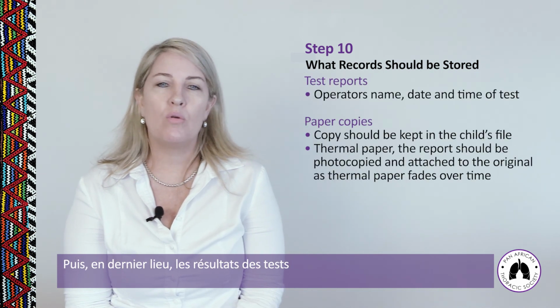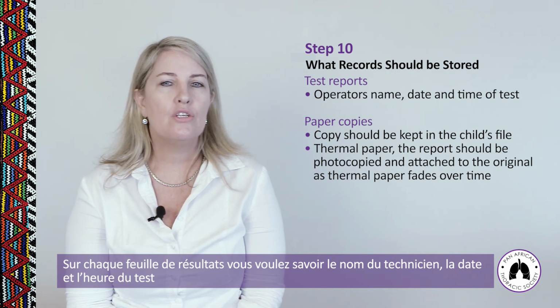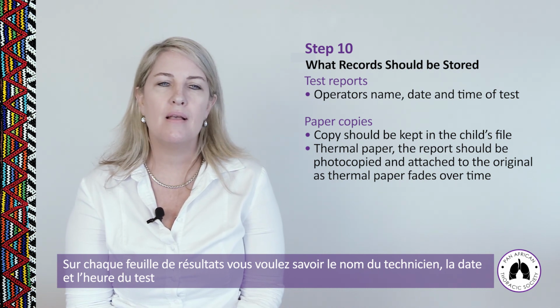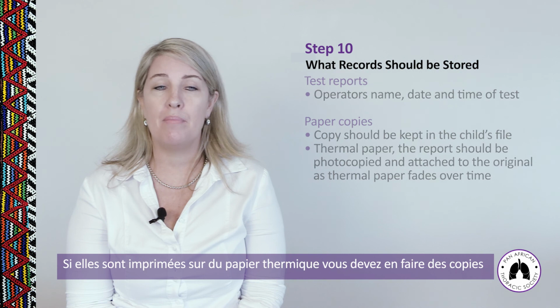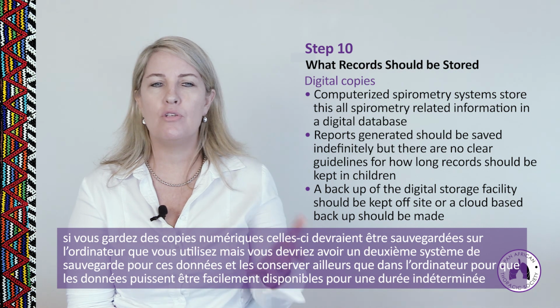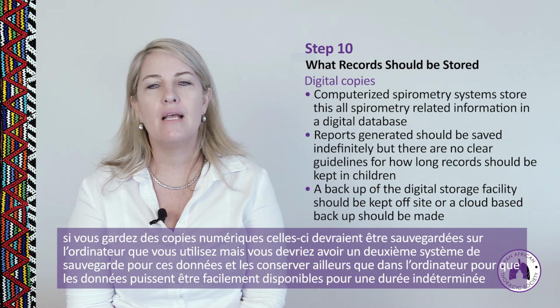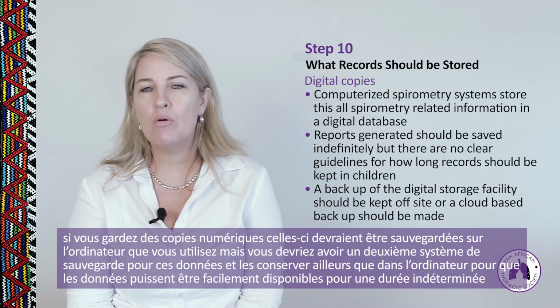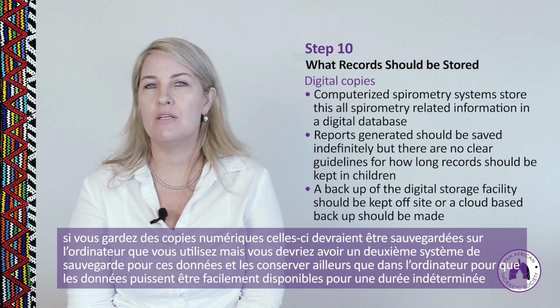Then lastly, the test reports themselves. On every test report, you want to know who the technician was who conducted the test. So the name, the date, and the time of test must be clearly visible on each test report. Paper copies should be kept carefully. If they are on thermal paper, they must be copied. And if you are keeping digital copies, then they should be stored in the computerized system, but you should have a backup plan for your digital storing facility, possibly kept off-site or away from the actual computer itself, so that the reports generated can be saved indefinitely and you can get easy access to data at the end of it.